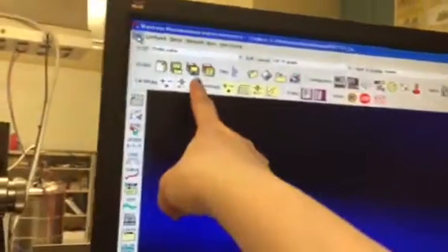Saving from the project here, so that saves the whole project. That's open a project and save the project. So it's going to save all the files and keep track of it.